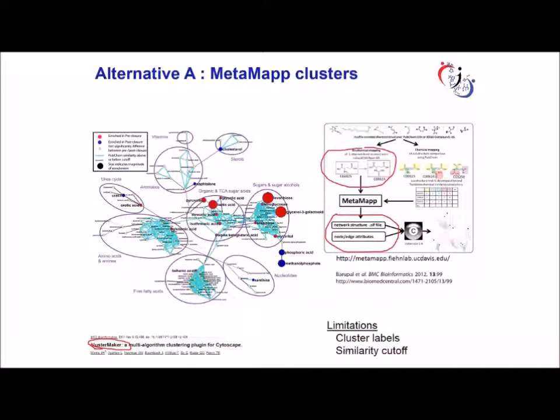Then also, the network graph is created using a similarity threshold of 70%, and the threshold has an impact on the size and definition of clusters. At a higher threshold we might get more clusters, and at a lower threshold we get a lower number of clusters.